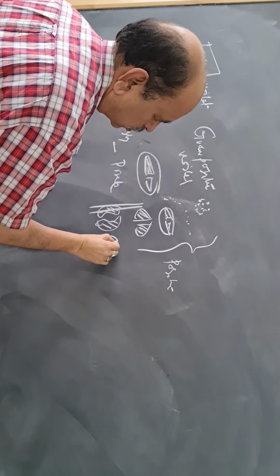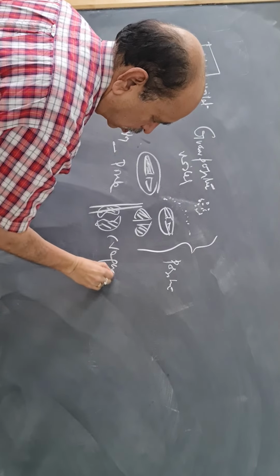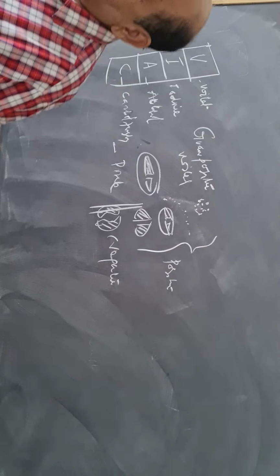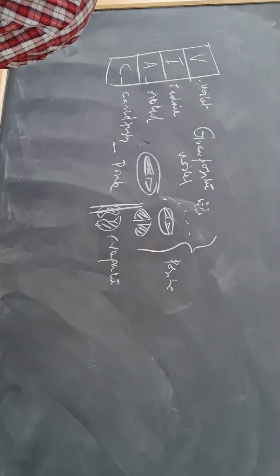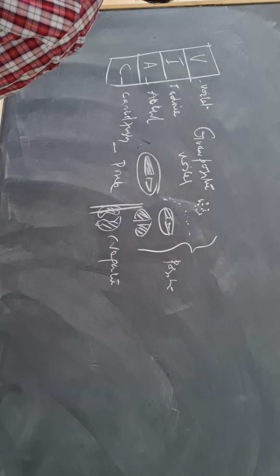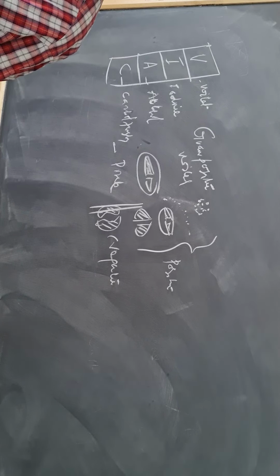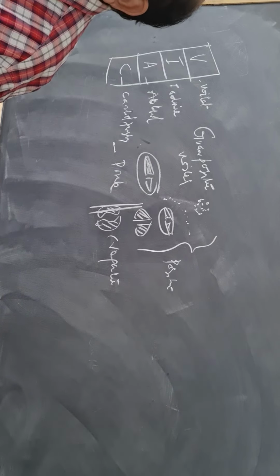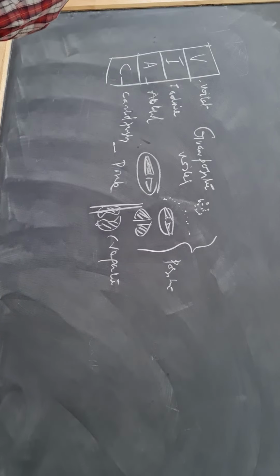and these are negative. Bacilli are rod-shaped organisms. They measure about 3 micron in length and 0.3 micron in breadth. They are also classified on 3 criteria: one is Gram staining, second is spore forming capacity, and third is acid fastness. Gram positive bacilli include Corynebacterium diphtheriae.